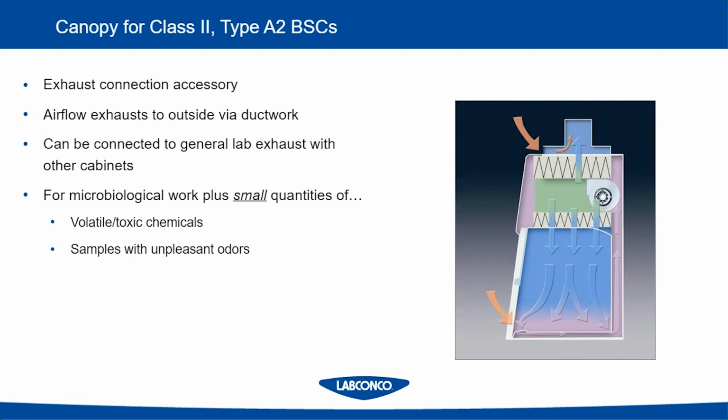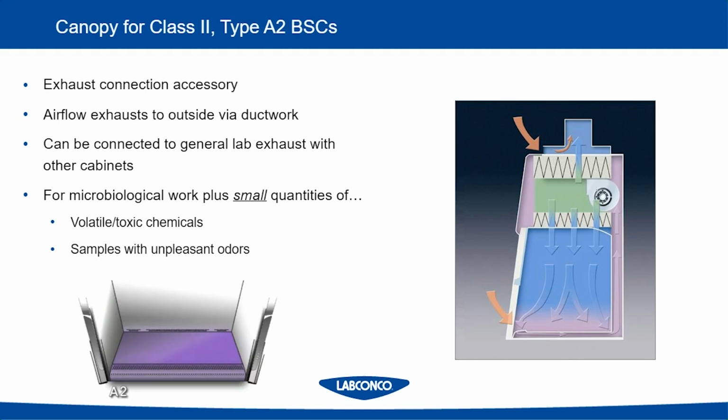Because remember, I mentioned that some of the airflow is being recirculated back in the cabinet. So you want to make sure that any of these chemicals, the concentration does not build up over time within the cabinet. So this works well for small quantities of chemicals, or sometimes if you just have an application that has unpleasant odors that you don't want being released back into the laboratory.